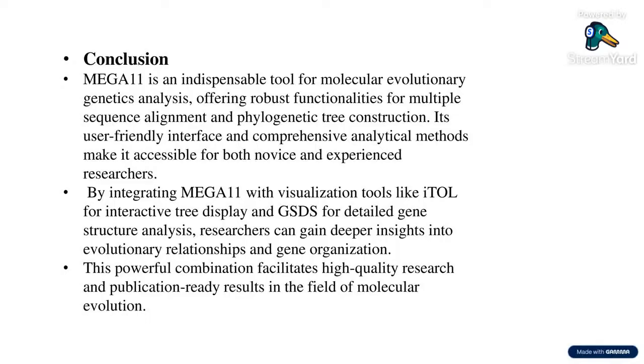If a student uses codon-based analysis, first of all, codon DNA sequences like CDS are used and aligned codon-wise, like a triplet-preserving alignment. The file format is MEGA or FASTA format. But the first thing is to align the amino acid sequences using MUSCLE or ClustalW. Then we will use it.